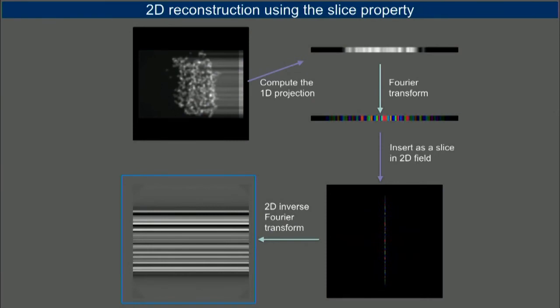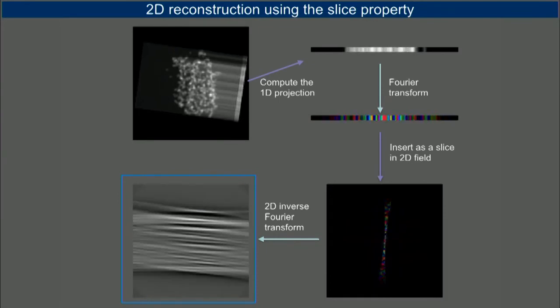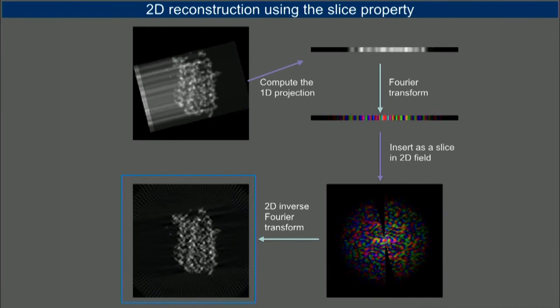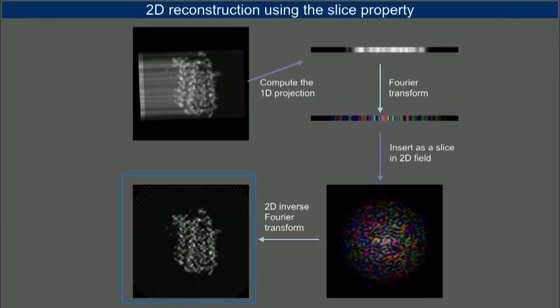So what I've done is take this projection and recapitulate it, but here it acts as if it's spread out into a beam, or a back projection, projecting back through that entire volume. So then the trick is that we rotate the object, or in this case, we rotate the projection direction, and we do this same trick: take Fourier transforms and insert them into different slices. And you can see that as we insert them into different slices, this back projection looking thing begins to change its appearance. Then as we compute lots of these terms, we start to get better and better reconstruction of the original object. So that when we have inserted slices at a sufficient number of angles, so that we have specified the value of voxels everywhere in the plane, then we can make a good 2D reconstruction.